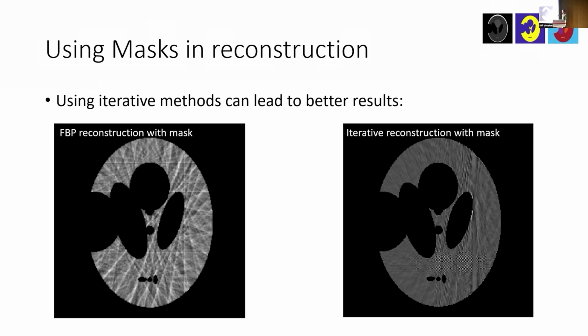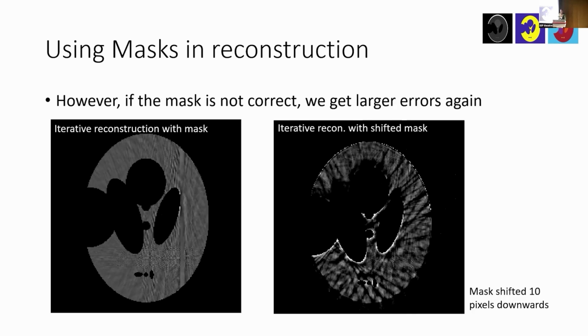And so this is just using the fact that we know where the shape is. Here we don't make any other assumptions. We assume a uniform gray level in the background. So this is just cutting out the object. This is actually not a super voxel in that sense, because if we had super voxels, we would obviously get that shape back with one gray value, which would then look like the original, but that's a bit contrived. So here we just use the mask to cut out the image, and the message here really is, a mask gets you that far, but there are issues with just using masks.